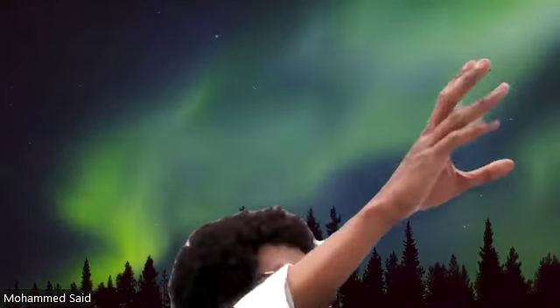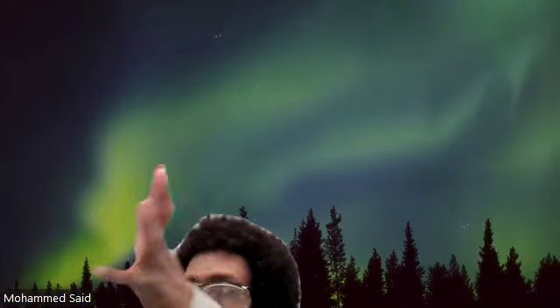So if we look down, and actually to separate you guys now, group 1 is going to be 50 degrees, group 2 is for 65 degrees, and then it's essentially the same here, except you're doing time 0 and time 5 minutes, meaning that those that get it from me as soon as possible, your group members need to be present.